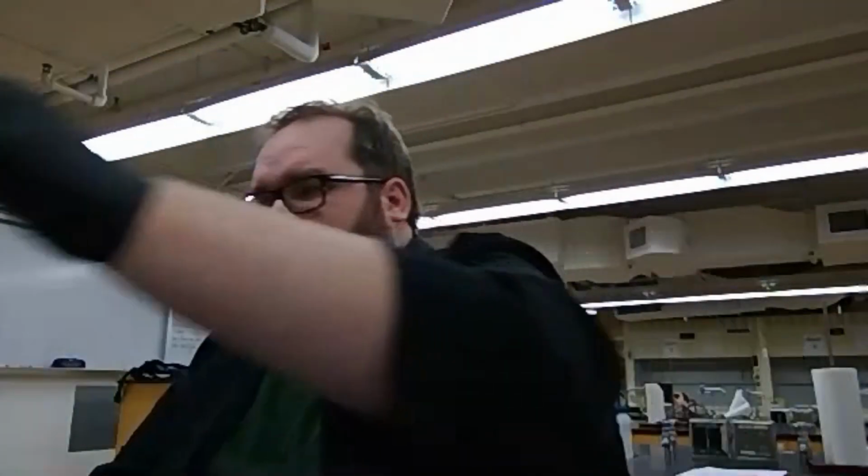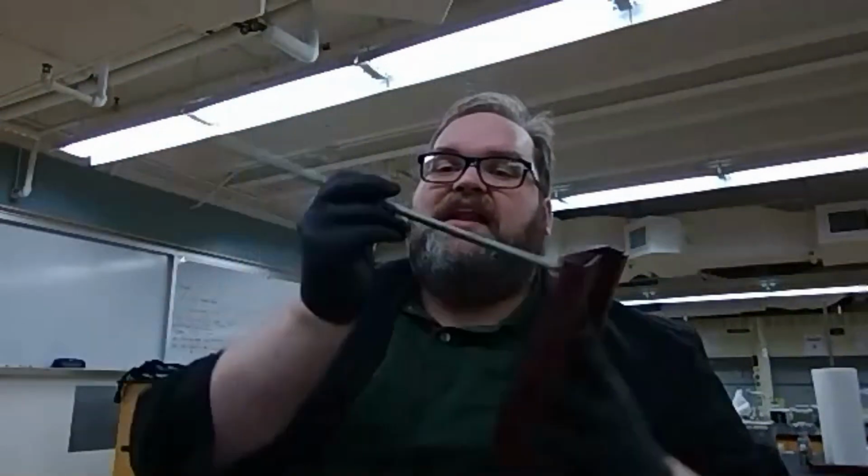Now, to do the separation, since we're going to be manipulating solubility, we need to be able to separate a liquid from a solid at that point because the sand will be solid and the salt will be in an aqueous solution or a water-dissolved solution. To do that, I'm going to need quite a bit of equipment. I'm going to need deionized water in a bottle ready to squirt. Okay? I'm going to need an iron ring stand with an iron ring.